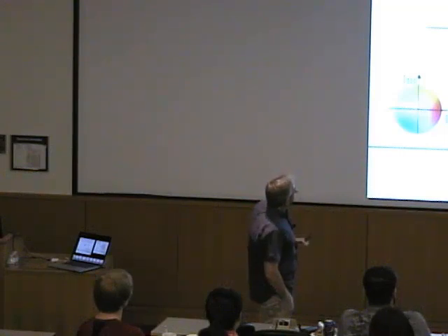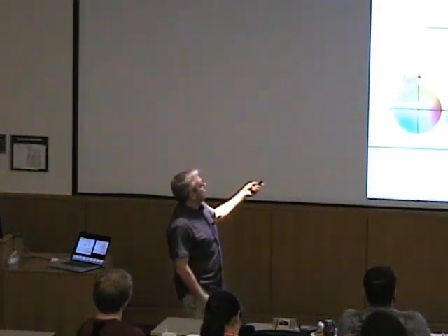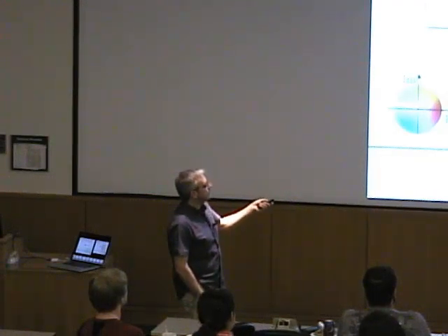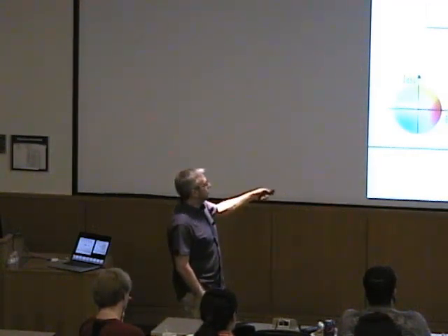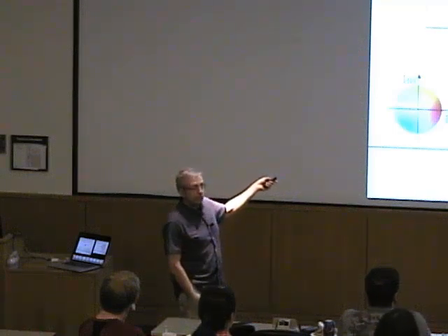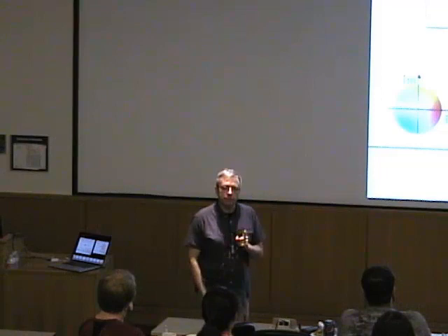If you start to look at a molecule, and you Fourier transform this, then you get some kind of a pattern that totally does not look like the molecule, but it obviously has some structure. The colors encode phase information. Okay, I'll say a bit more about that in a moment. And again, the information contained in here is all you need to invert that transform and go back to the picture of the molecule. That's what we're doing. Now we're having crystals.